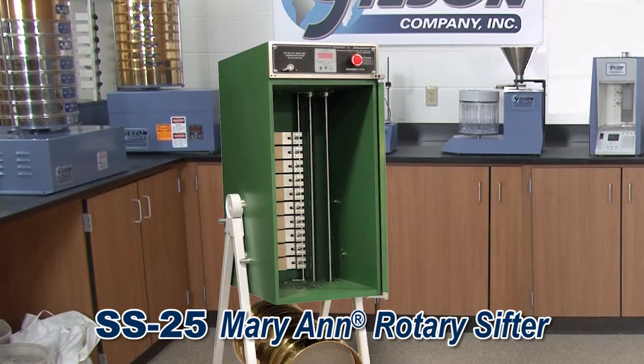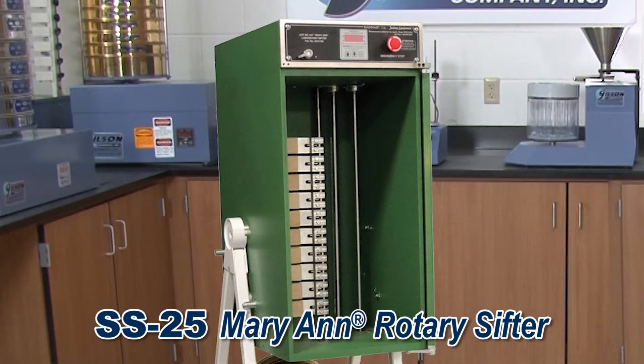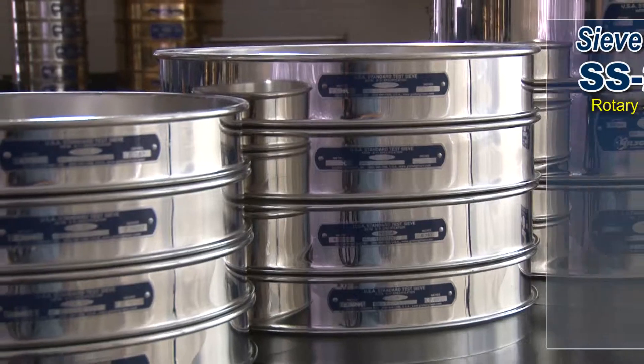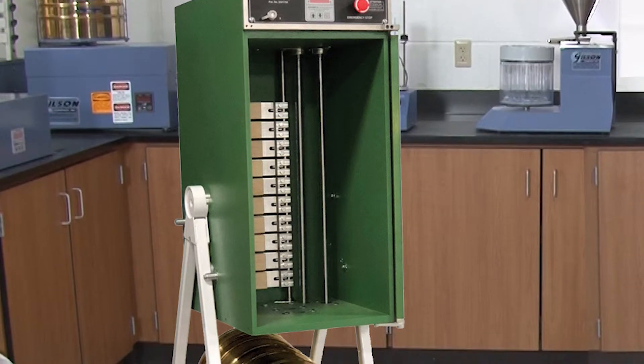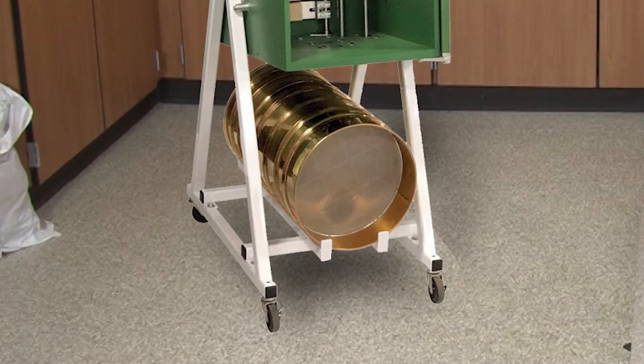The classic Mary Ann rotary sifters are a widely recognized tool for efficient particle size separations. The Mary Ann sifter as well as the Gilson laboratory sifters can accommodate either 8 or 12 inch diameter test sieves, as well as 200 millimeter and 300 millimeter diameter test sieves. The Mary Ann has hardwood-faced tapping hammers that assist passage of material through the sieves and now come with rollers for laboratory mobility.